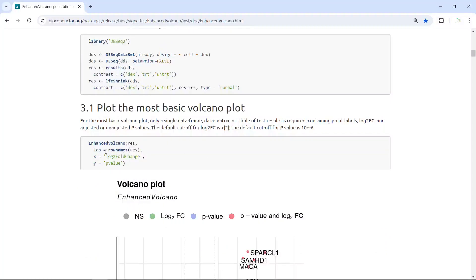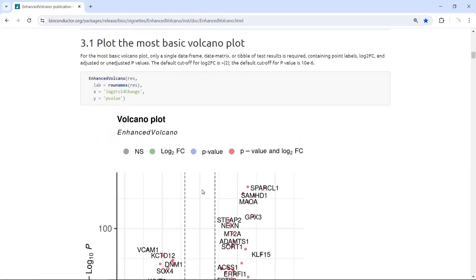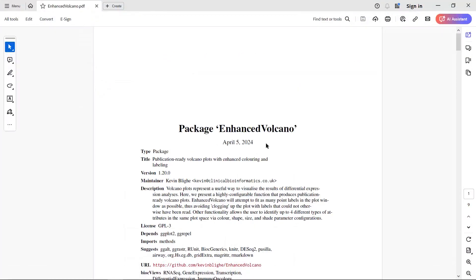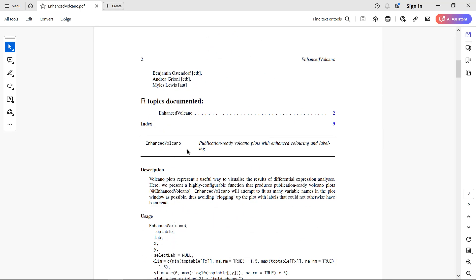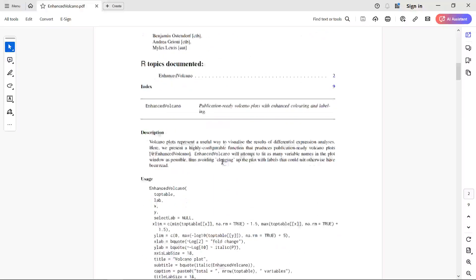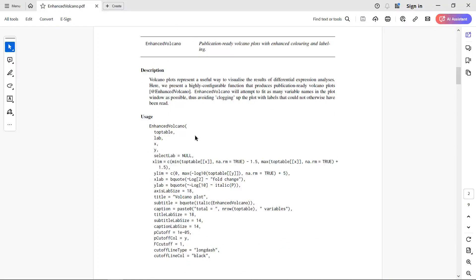For the enhanced volcano plot package, you just need to run one function — EnhancedVolcano. But there are different arguments for this function that you can use to generate a more beautiful volcano plot. We can have a look at the arguments in the enhanced volcano function. You can see the package information, and there is only one function called EnhancedVolcano. Inside the function, there are lots of arguments.